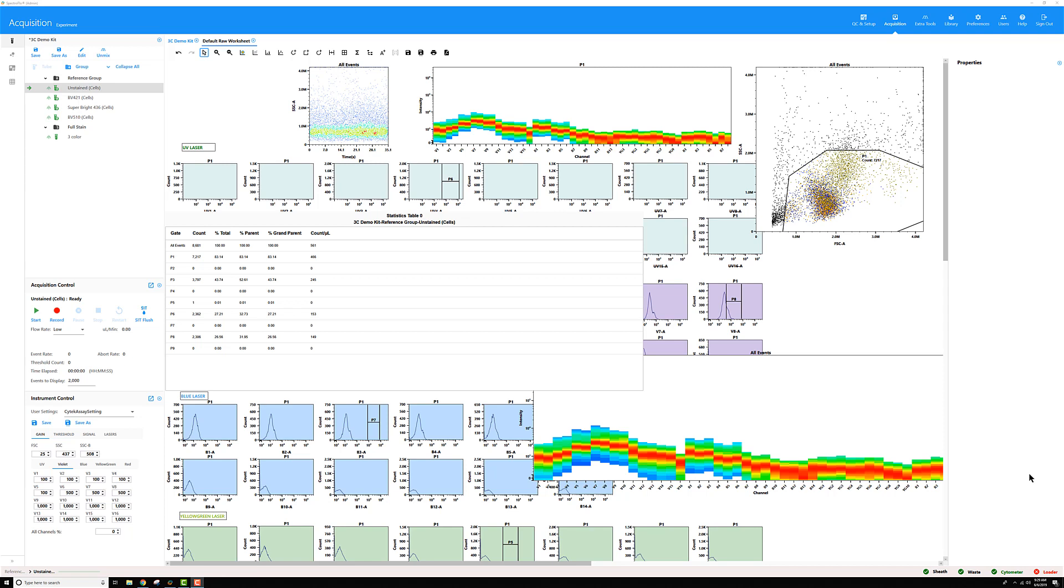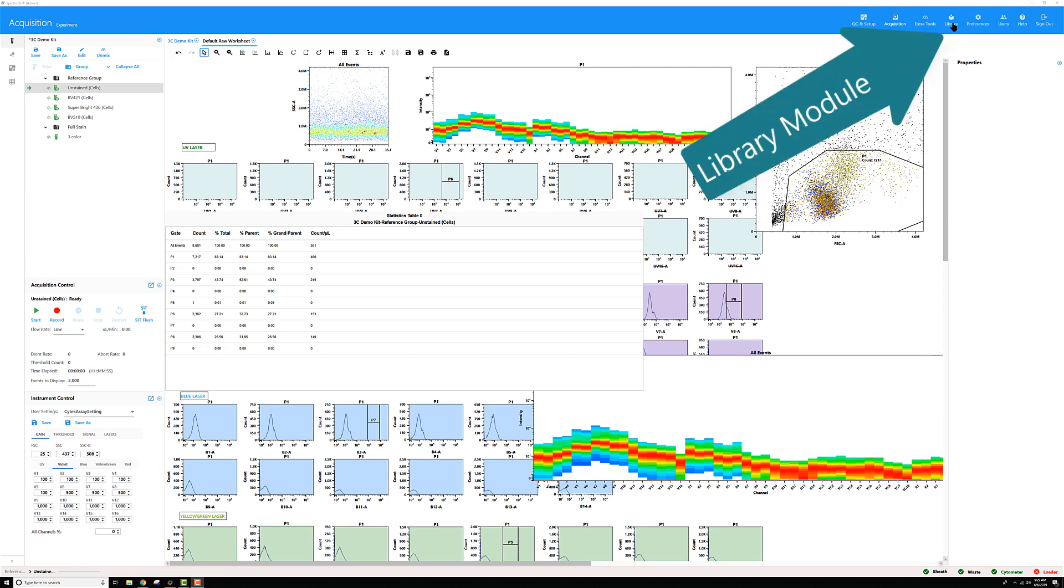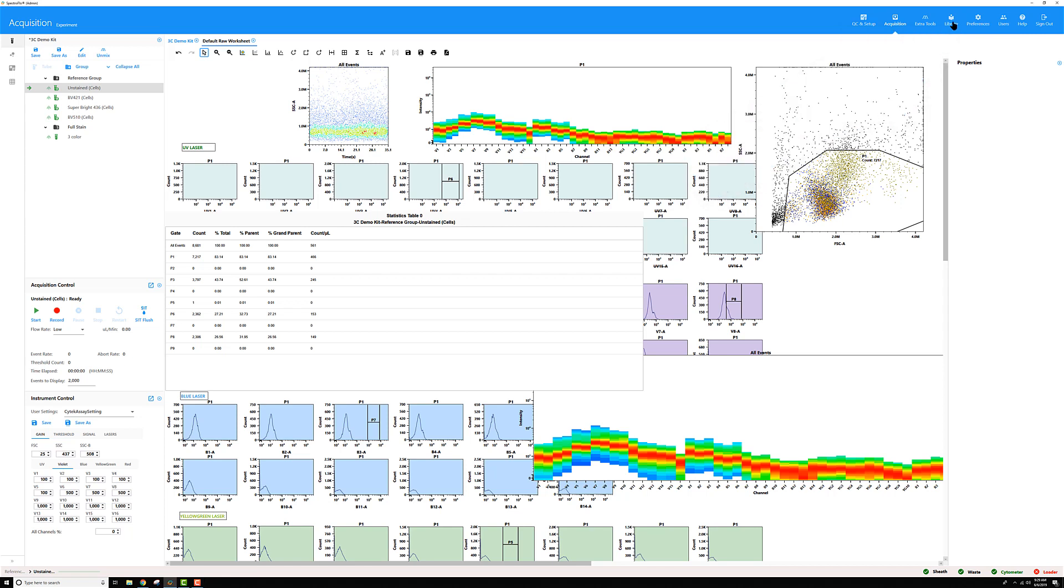So how do I get my default raw worksheet back to the way it's supposed to look? All you have to do is go over here into the library section, then on the left select worksheet templates.